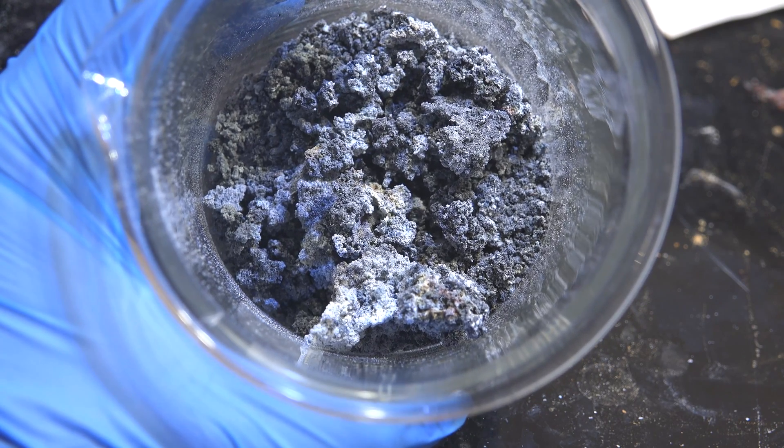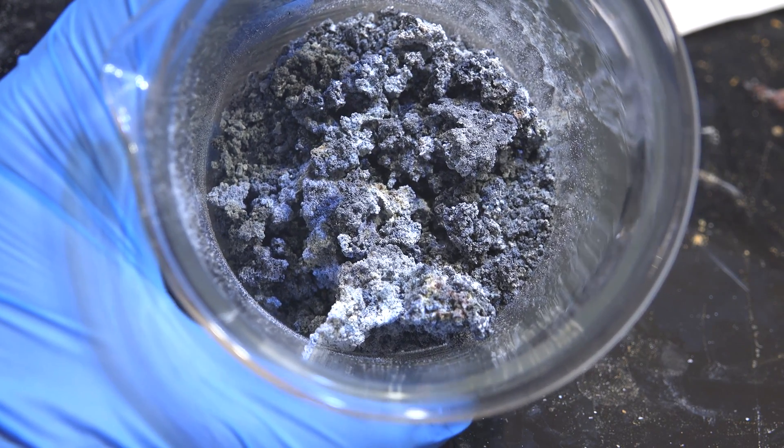I recommend storing it under mineral oil or toluene. Otherwise the activity will rapidly decay until it no longer reacts with water.